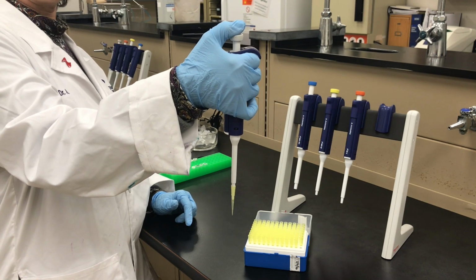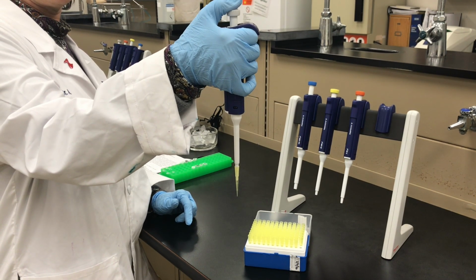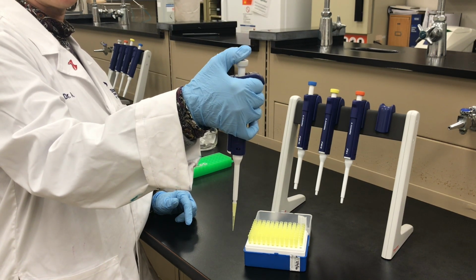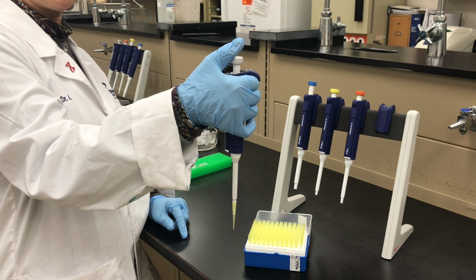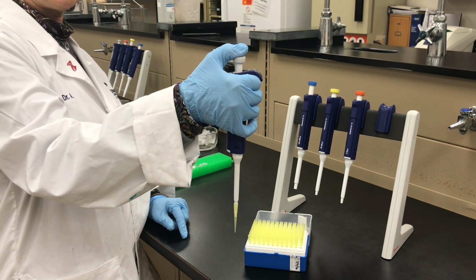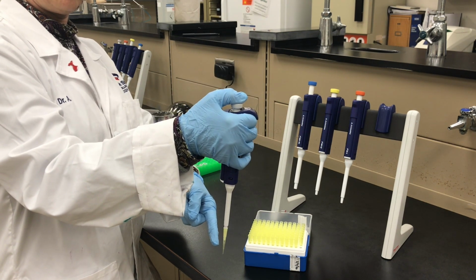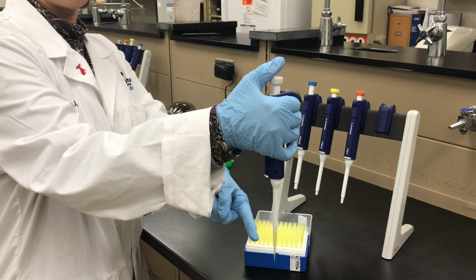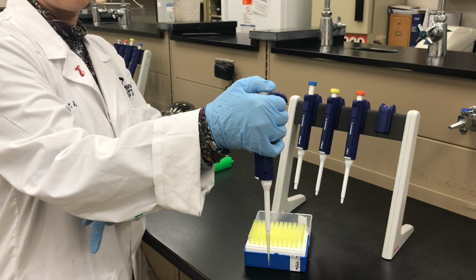Most people, the thumb's the strongest. This is the motion for sucking up the liquid and for spitting the liquid out. So similar to those pipettes we use for the plate count, push this down, stick the tip in the liquid, release, it sucks up the liquid. Now move your tip to where you want it to go, push all the way down to spit the liquid back out.